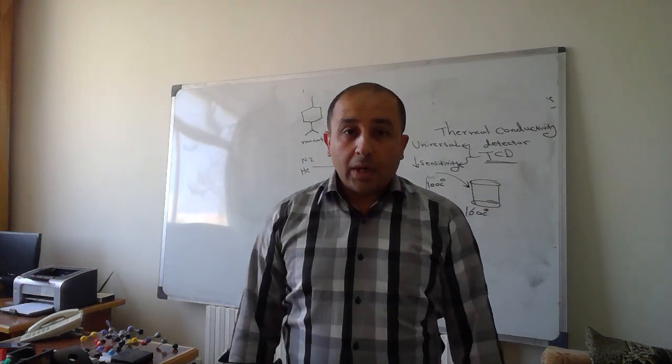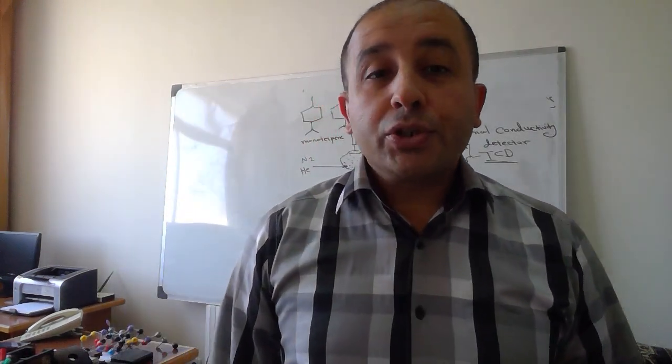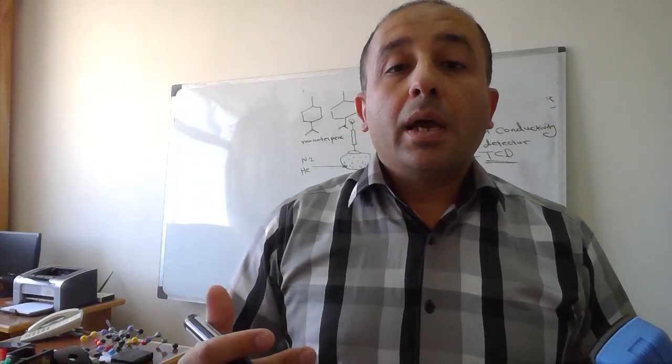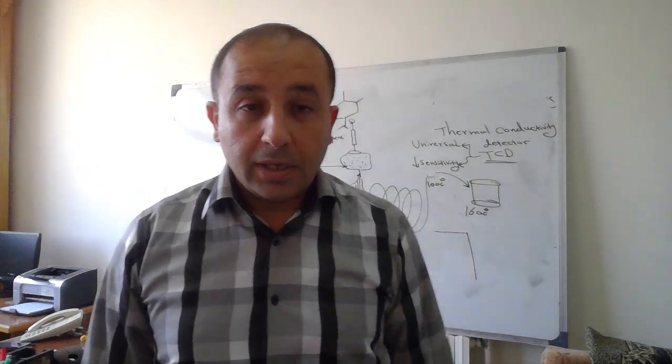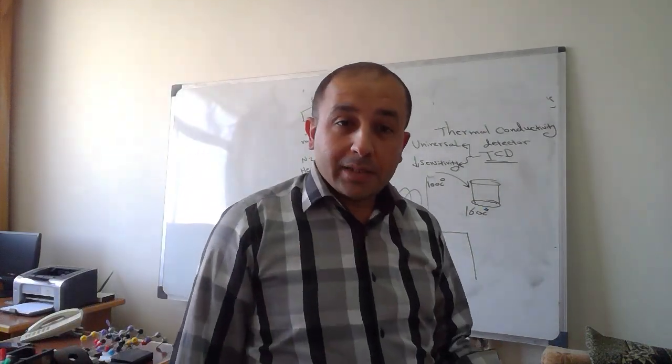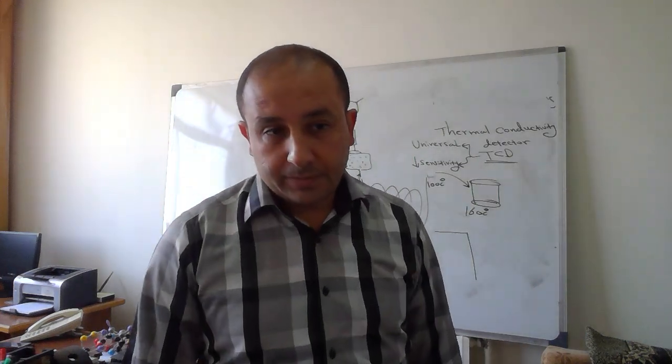Okay. Now the declination of temperature will be proportional with the size of the blow of the cloud. Okay. So more analyte means more reduction of temperature.